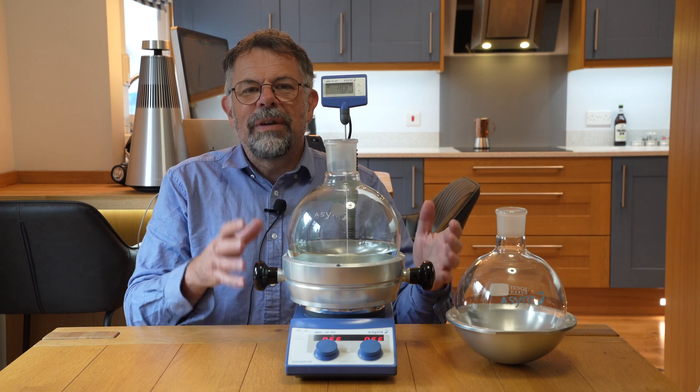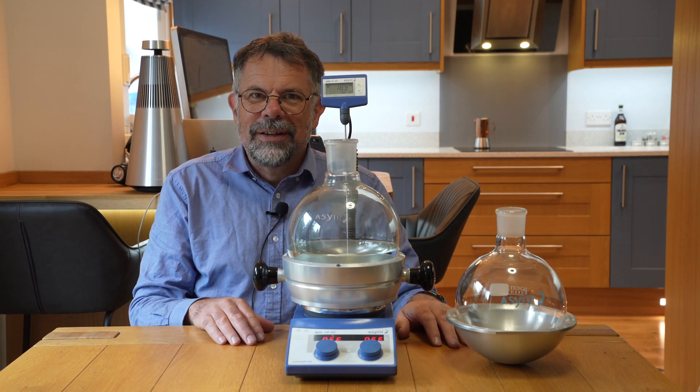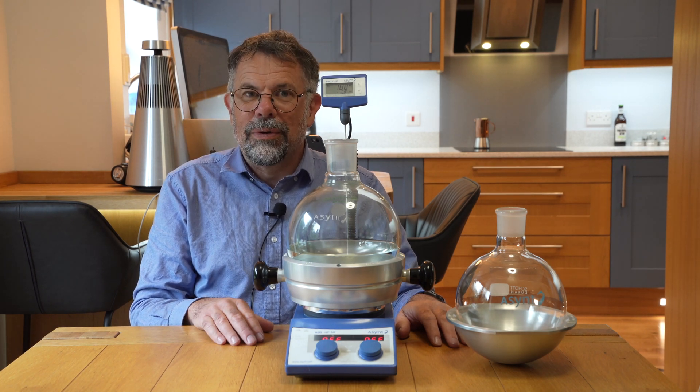Very simple, very effective — tried and tested, the Drysyn Maxi for 2 and 3 litre flasks in your fume hood.